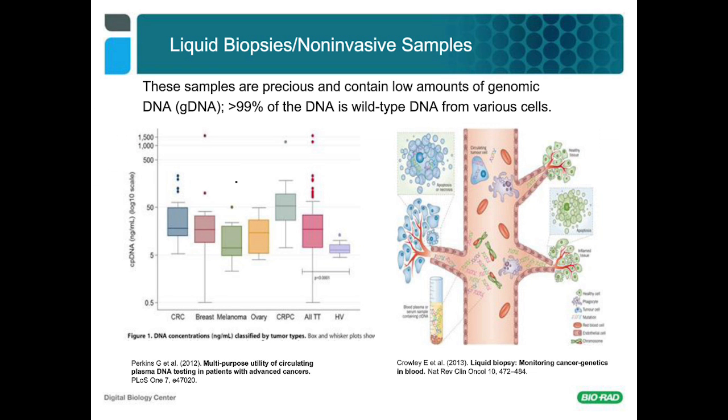Today's webinar will focus a lot on cell-free DNA. So the liquid biopsy is a holy grail in diagnostics since it is largely non-invasive and believed to be more representative of the overall body, rather than a biopsy of a tumor in a single location. In addition, multiple biopsies over time are considered impractical, expensive, and can be extremely dangerous for the patient.